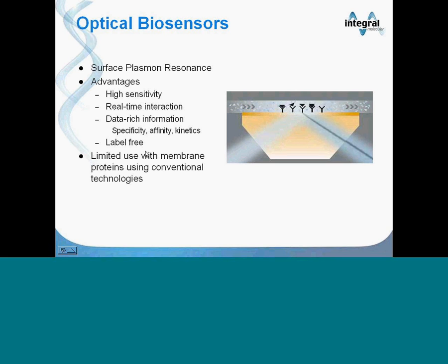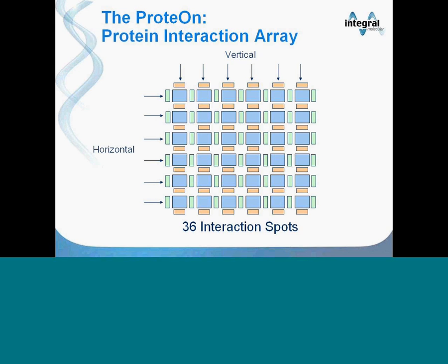The first assay I'm going to describe is the antibody binding assay. In this assay, lipoparticles are immobilized onto the sensor chip surface, and antibody is flowed across in different concentrations so that the detailed kinetics of the antibody binding can be measured. First, I'm going to go into a little more detail about the lipoparticle immobilization. It's the first step for this assay.